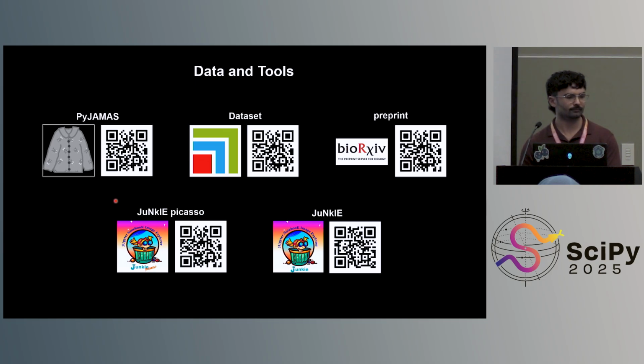Sneakers the Rat asks, loves the focus on small data, big fan. Could this approach be adapted to genetically encoded calcium imaging of neurons, where the positions of the neurons are static after stabilization, and segmentation depends on recognizing regions that have dynamics that match some canonical temporal pattern or kernel? Interesting.